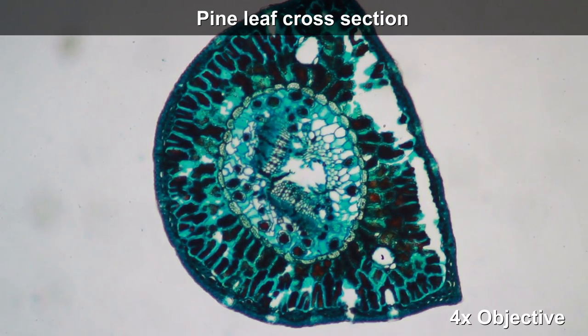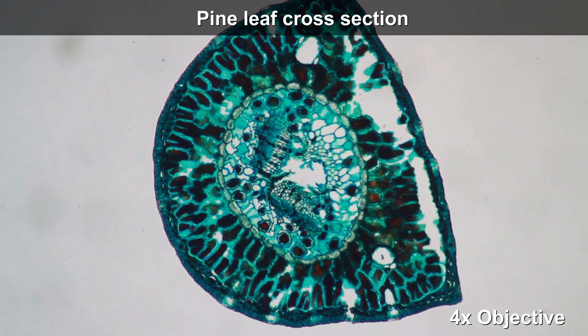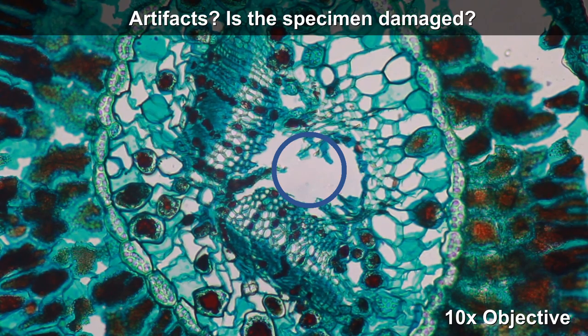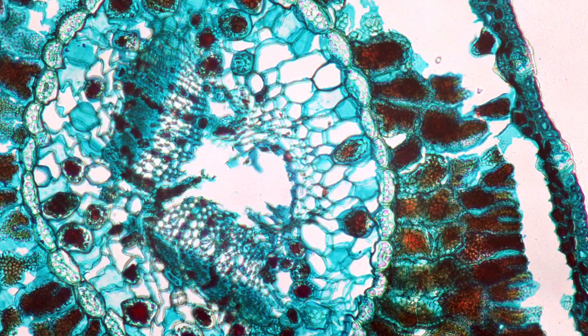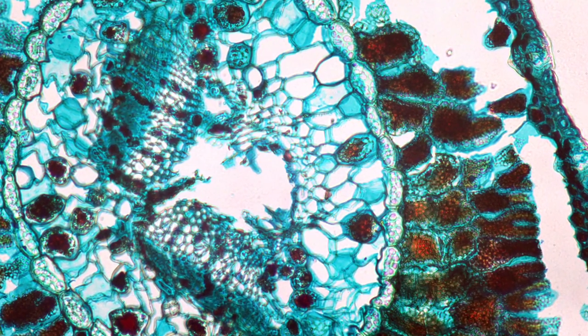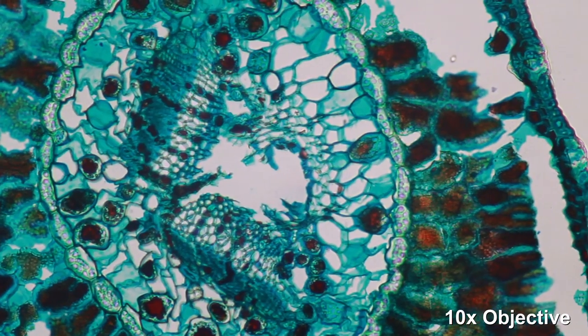This is the cross section of the pine leaf. Lucky that at the lowest magnification we can see the full specimen here. I saw that the center had a little gap there, and I think that this could indeed be an artifact—the specimen is a little bit damaged. It doesn't matter so much; it looks nice in any case.